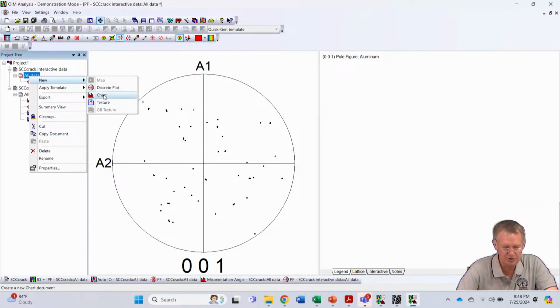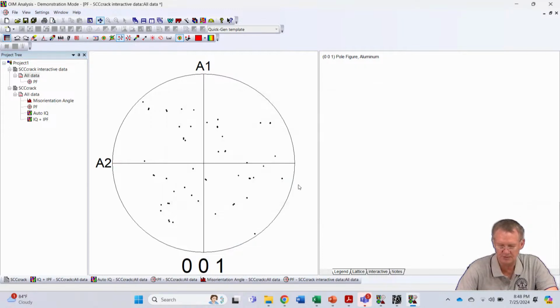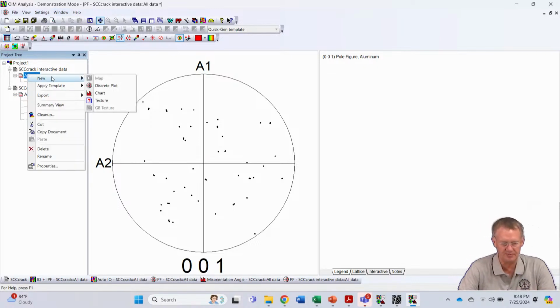It should tell me I could interpret it a certain way, and then it should tell me that, but it's not allowing me to do that. So hopefully in yours it comes up and you're able to say, okay, let's do a misorientation texture or something like this. See, I should be able to calculate a grain boundary texture because it's just misorientations there.